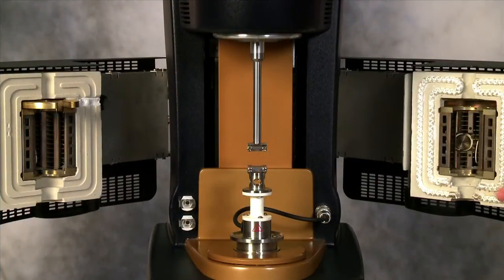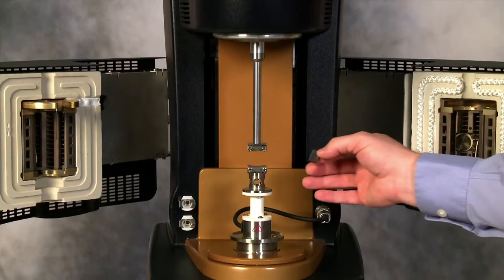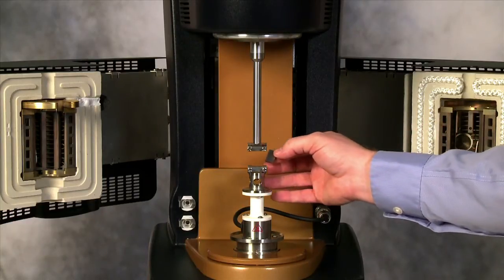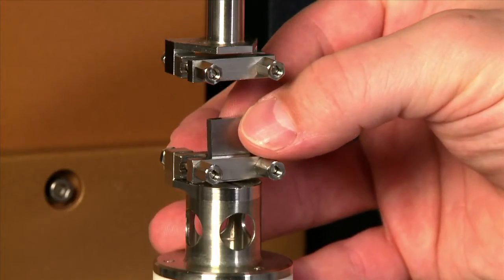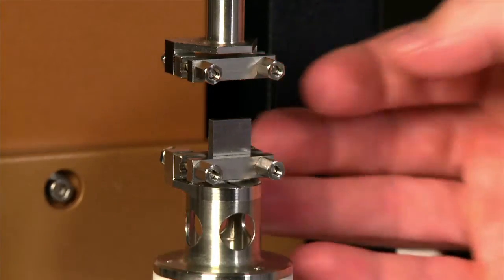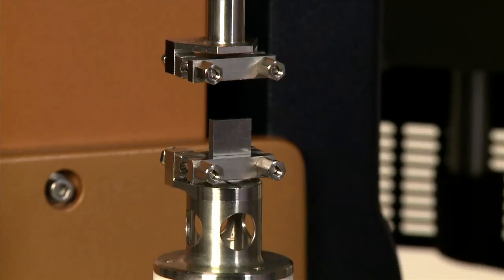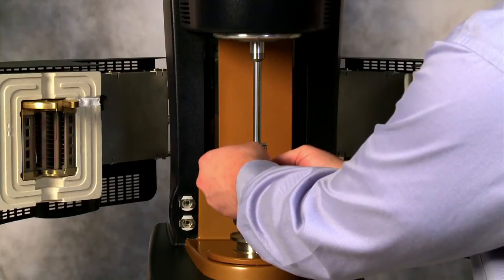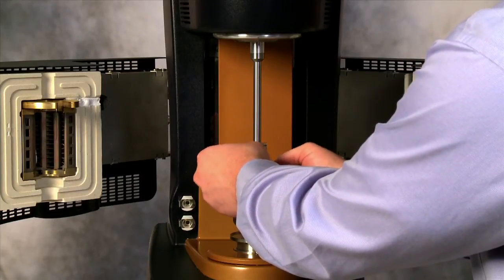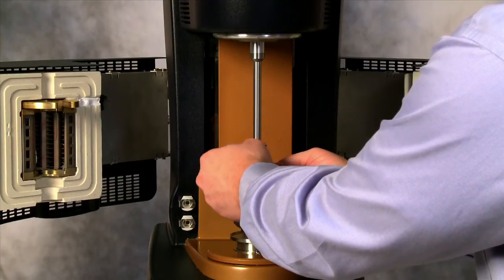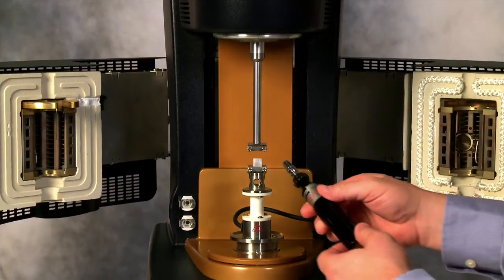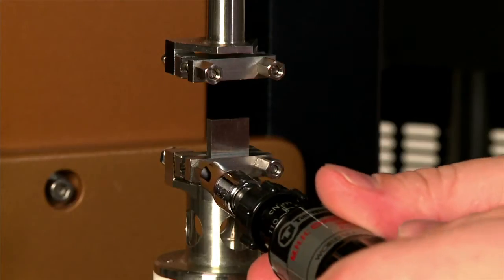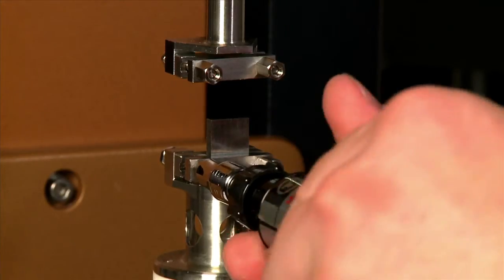Now load the stainless steel compliance sample into the lower geometry. Make sure that you have it centered and vertical, and tighten into place. Use the torque wrench to tighten between 80 and 100 cNm.